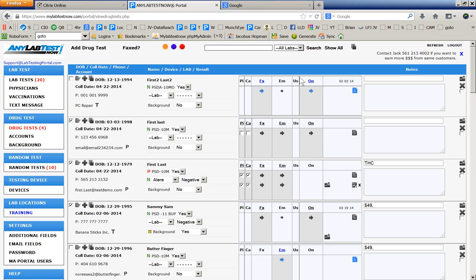And it also pre-formats how the company wants to get reported. This company wants to have a fax reported and look it up online. So those arrows are fat blue. So once you're done with reporting, you do the same, you check the checkbox. Is everybody following this? Tell yes if you follow it, tell no if you have a question, and please ask that question.